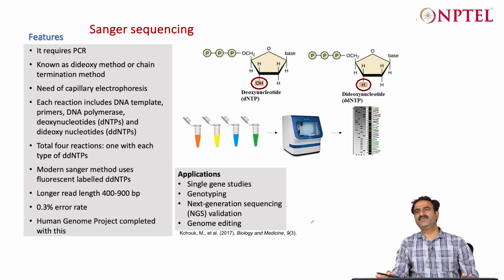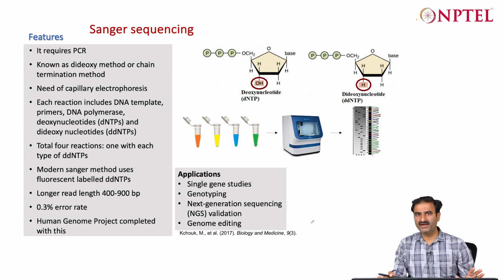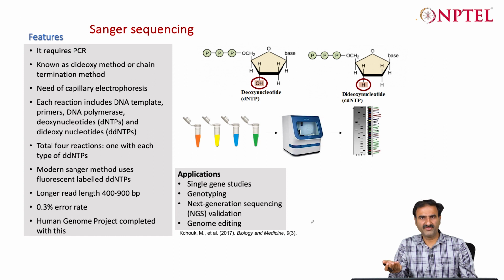So Sanger sequencing is basically the gold standard for species confirmation, because you would not like to go for a lot of coverage or depth of sequencing, and also you are dealing with a single gene or product at one point of time. Although you may have multiple markers, you will do them one by one. So Sanger can give you the desired result in less than 1000 rupees. You can get both forward and reverse reactions done. Generally 350 or 400 rupees is the cost for one reaction.